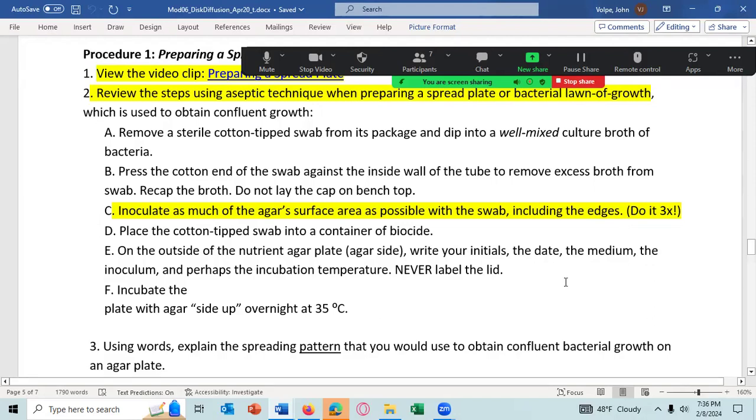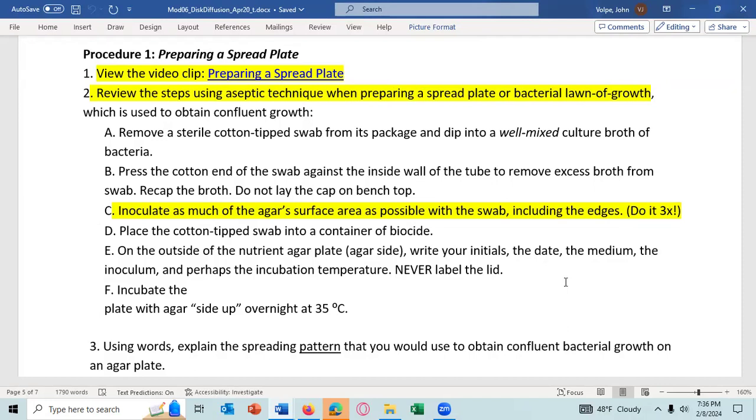You then take the plate, obviously you put the lid on, and then appropriately label it if it's not labeled, and then put it in the incubator. Oh, wait a minute, no, you don't. First you have to put the bacteria on. So then you let the bacteria and the media sit for 5 minutes.